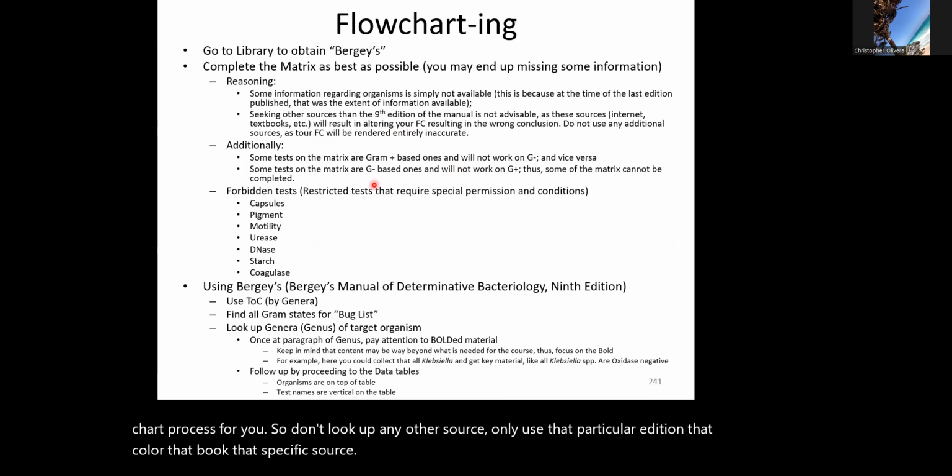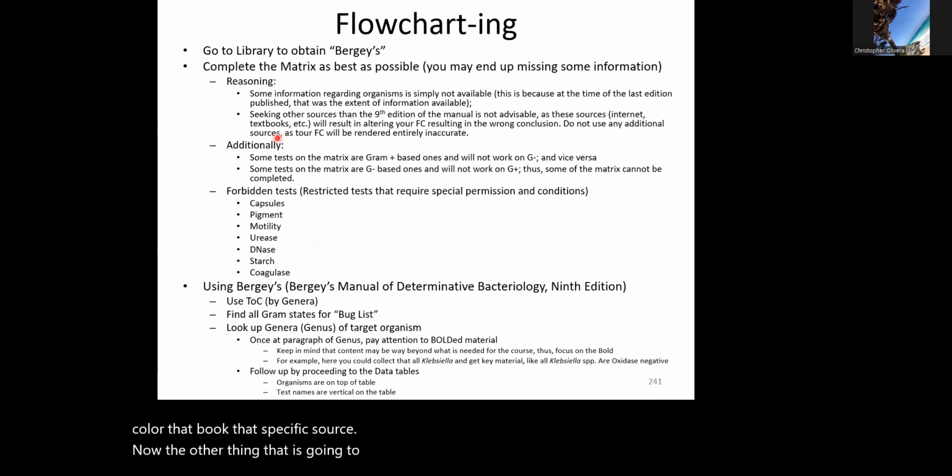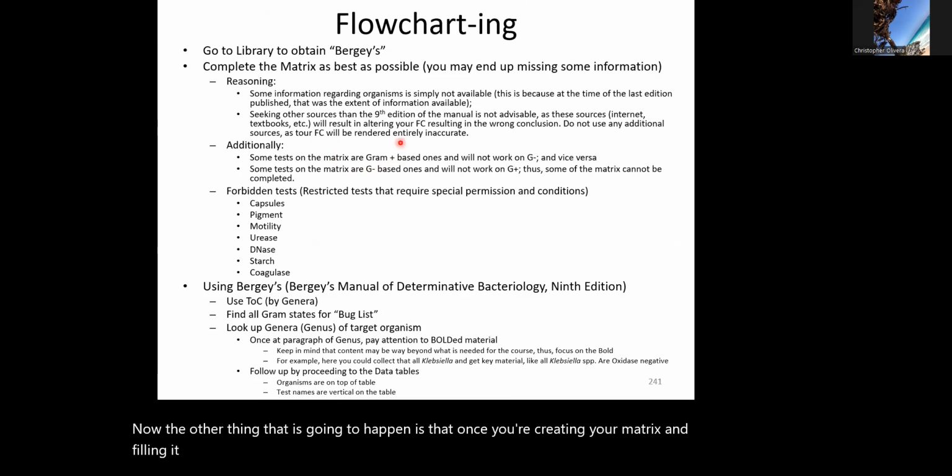Now, the other thing that is going to happen is that once you're creating your matrix and filling it out, certain tests only apply to certain species or to certain genera. So some of those will not really apply to you. So keep that in mind.